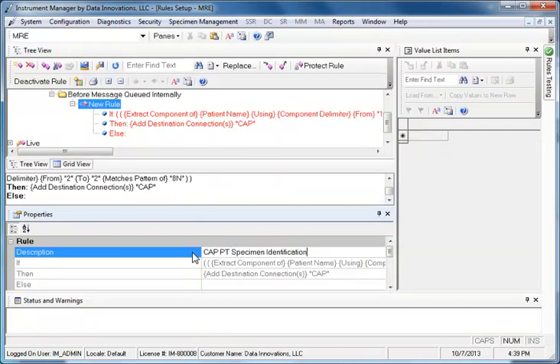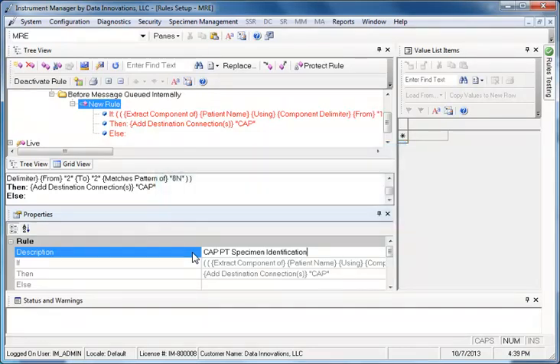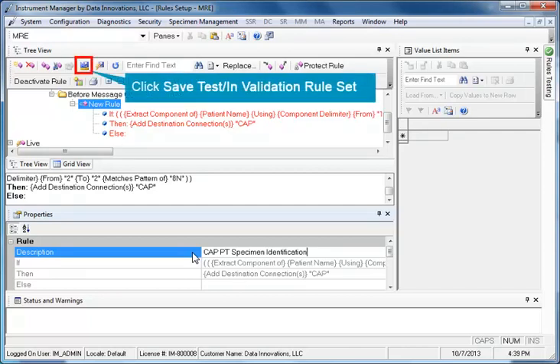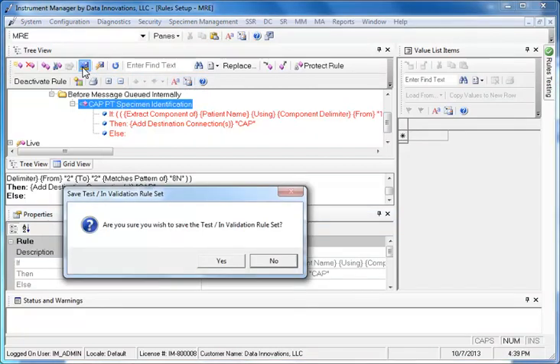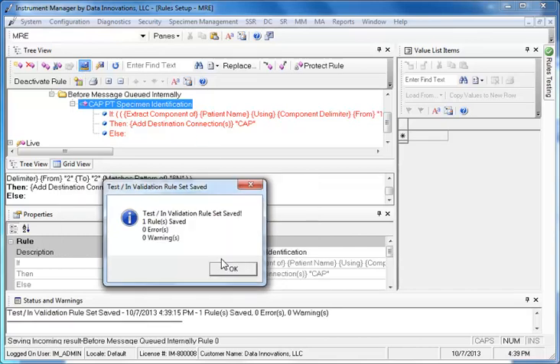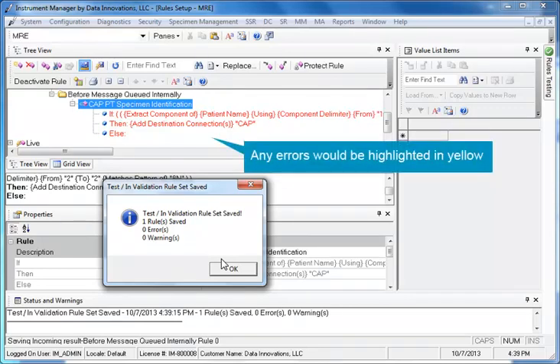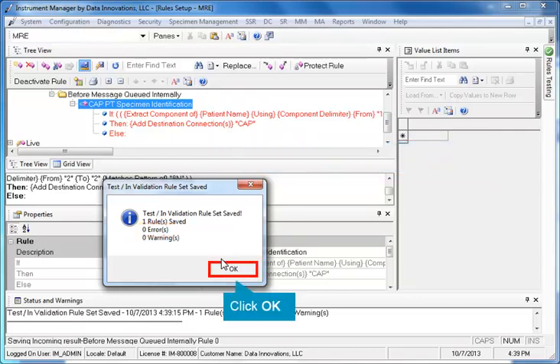Now you can save the rule. There are two steps to saving a new rule: testing the rule set for errors and saving the live rule set. To test the rule set, click the Save Test Invalidation Rule Set button. A dialog appears asking you if you're sure you want to save the rule. Click Yes. Another dialog displays the results of the save process, including errors, if any. If an error in the rule is detected, the error will also be highlighted in yellow. If there were an error, you would have to go back and fix it. There are no errors here, so click OK.